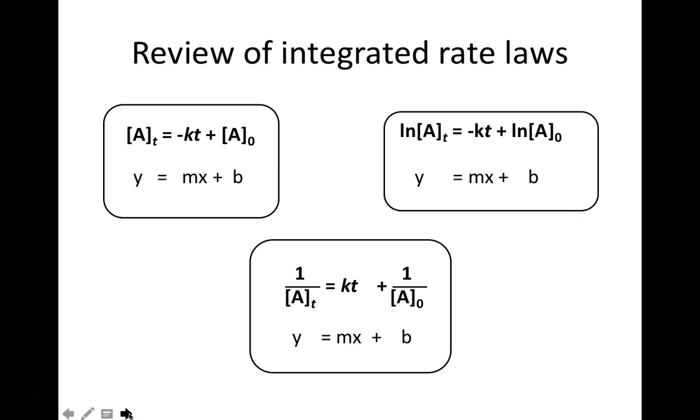I'm going to give you the heads up right now. First and second order reactions are going to look very similar to each other. The zeroth order reaction will be pretty obvious. My recommendation is to fit your data points using the least squares method, which means put a straight line through it and have Excel return y equals mx plus b for you.